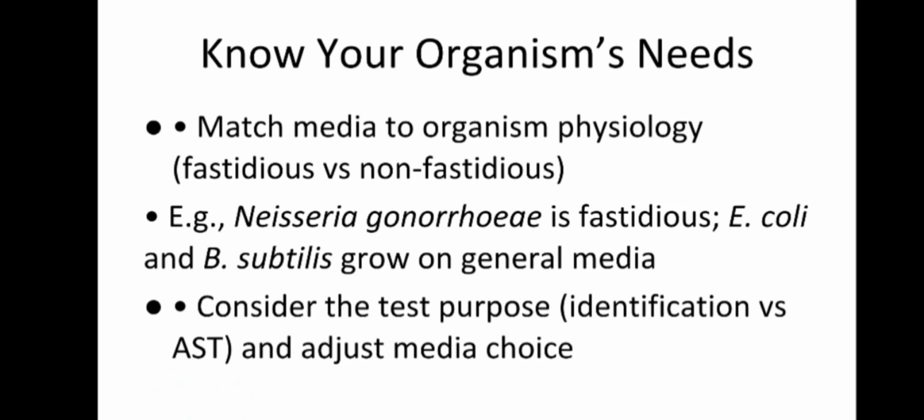What is this heated blood agar? Heated blood agar will show a characteristic chocolate color. That's why you call it that, because they need a growth factor and heme, which is released by heating the blood. So they grow in that agar, whereas E. coli and Bacillus subtilis grow well on a standard nutrient agar like nutrient broth, Luria agar, or Mueller-Hinton agar. Mueller-Hinton agar is a specialty agar.